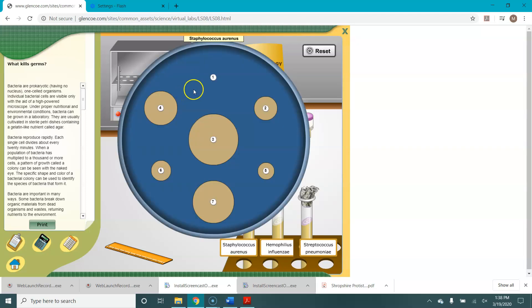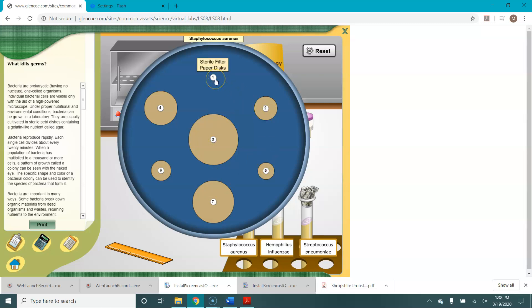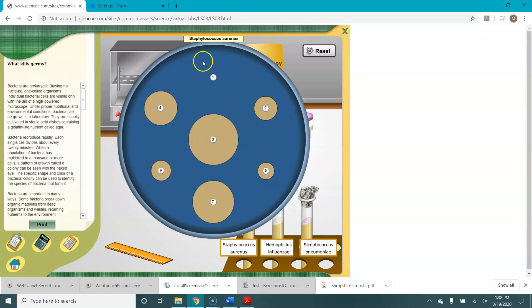So what are we seeing here? The white discs are those paper discs that came from the vials, each one of which was soaked in some kind of antimicrobial agent or sterile water if it's this one. The blue represents bacteria. This whole thing is the lawn of bacteria growing all over the surface of the plate.